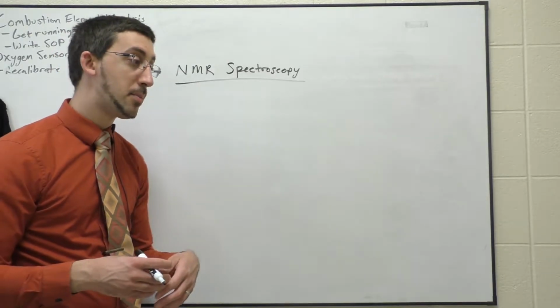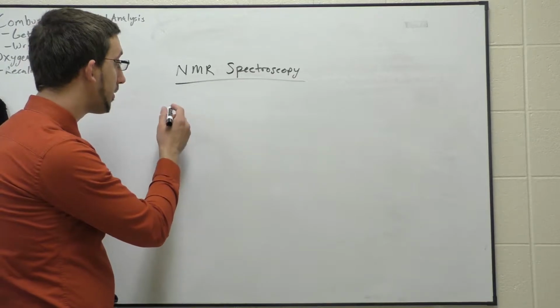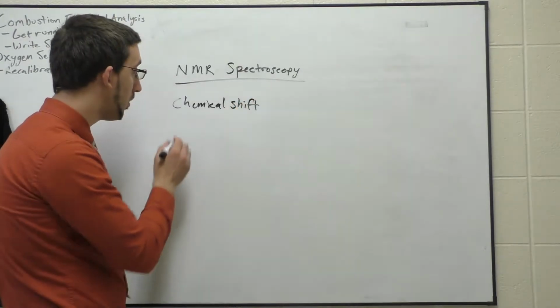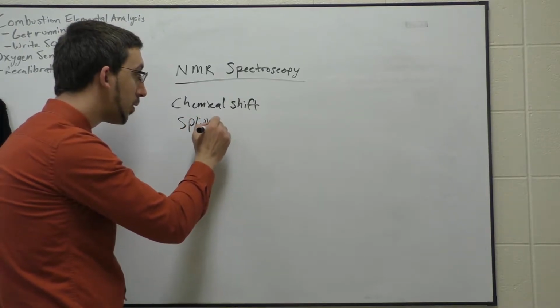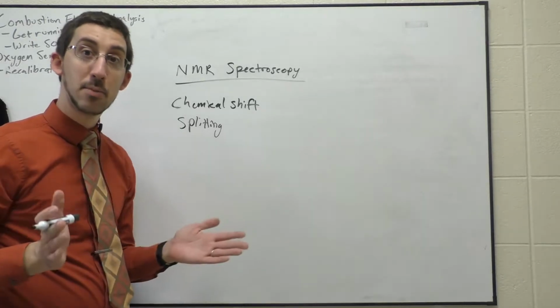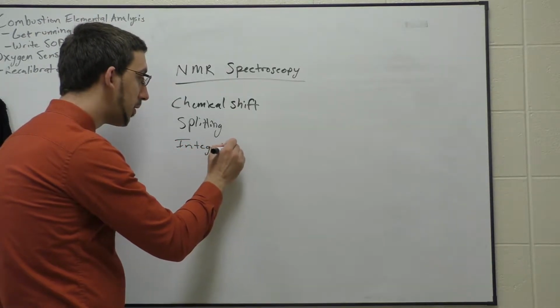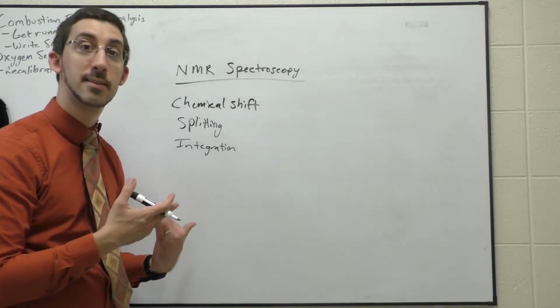And so we know several things from theory for NMR, certainly gone over primarily in class or in pre-lab reading. Primarily, the main things that we look at in proton NMR are going to be its chemical shift value, the splitting, which tells you about its environment, the number of hydrogens on neighboring carbons, which is very useful. And then finally, the integration. This will tell you about the number of hydrogens that correspond to that signal.